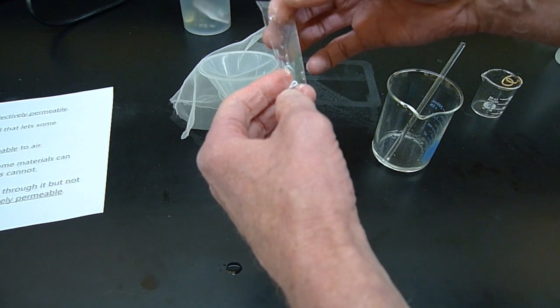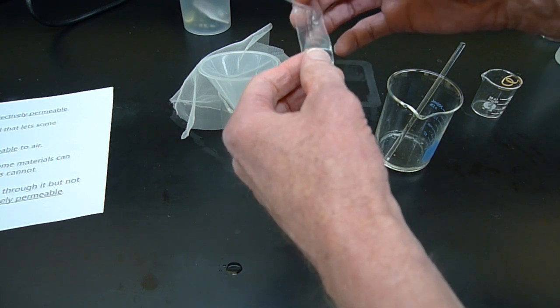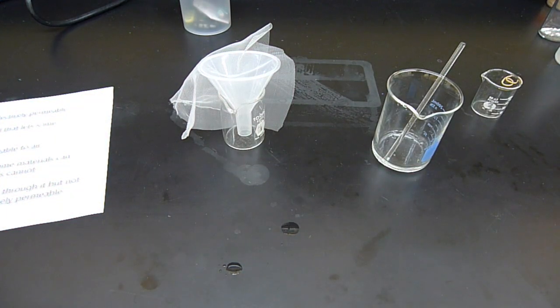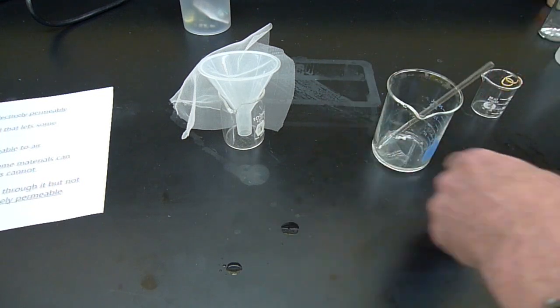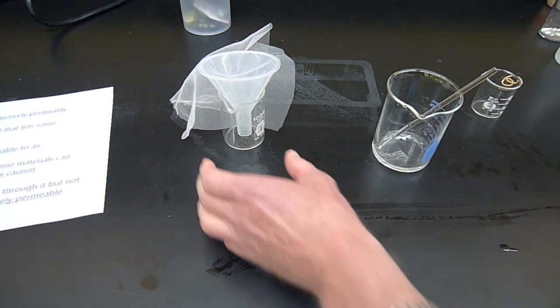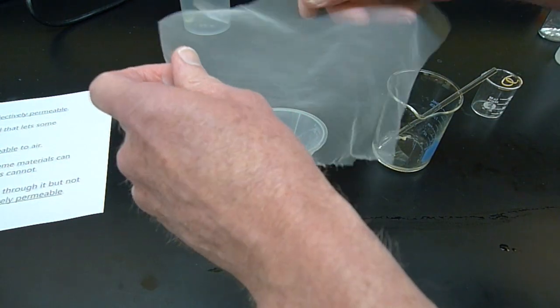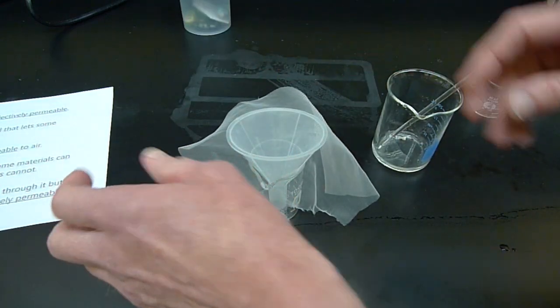I'm going to put a couple of solutions in here, and the pores will let some things pass through but prevent other things from passing through. To give you a feeling for how this works, here is a piece of nylon mesh. The holes in the nylon mesh are similar to the pores in the dialysis tubing that's been tied into that bag.